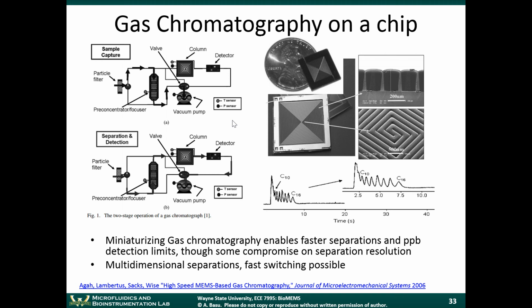They've gotten to the point now where they can detect complex mixtures of things like explosives. They've done exhaled breath analysis to diagnose tuberculosis. These are very nice, interesting systems where they separate out a mixture of gases using a long column, similar to chromatography, but in the gas phase instead. Gases separate out in time, and you get these chromatograms. This is a big area of research in the MEMS community.